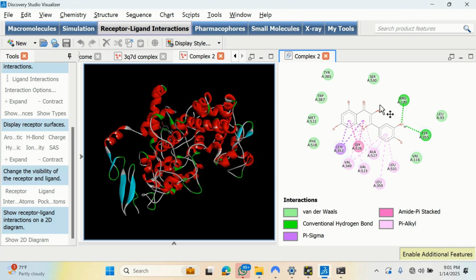Because in the course of this, you're supposed to explain in detail, define and discuss in detail why your choice of such pose, why so and so is happening within your interaction. So your ability to pick the ligand making interaction with your key amino acid or your key active site residues, the better for you to be able to explain the outcome of your result. And remember, these key active site residues are also the residues you target in your site-specific molecular docking.